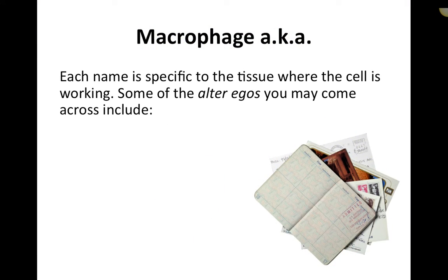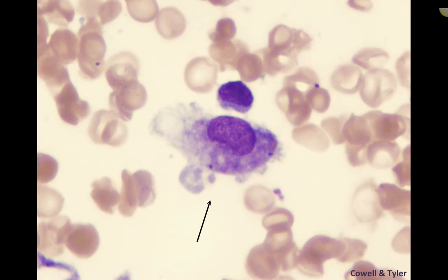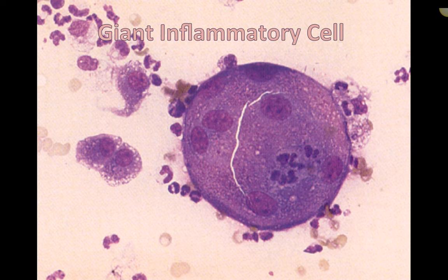Macrophages have different names because each name is specific to the tissue where the cell is working. Their alter egos include histiocytes, mesangial cells, Kupffer cells, and epithelioid cells. Histiocytes are macrophages of connective tissue, mesangial cells are macrophages of the kidney, Kupffer cells are those of the liver, and epithelioid cells are found throughout the body. Here's another macrophage and a giant epithelioid-type macrophage.